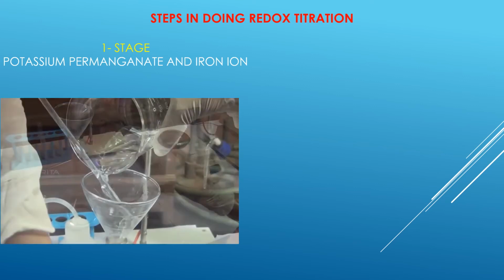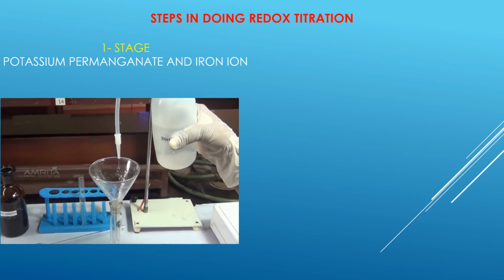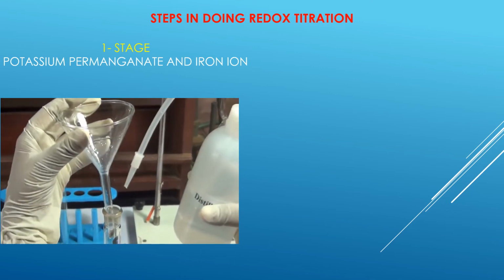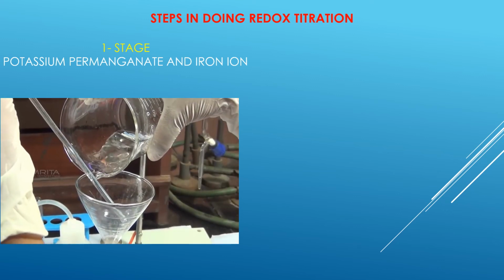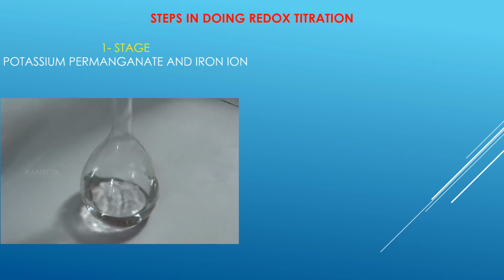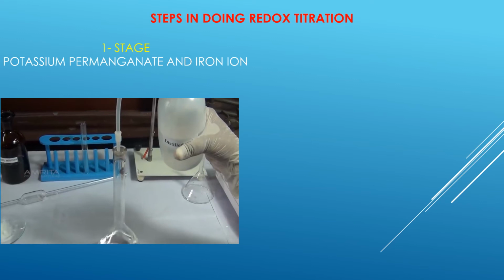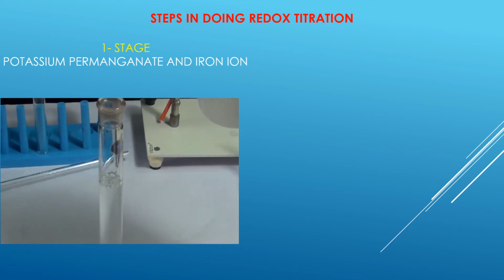Wash the beaker, glass rod, funnel and funnel tip 2 or 3 times with distilled water to be certain none of the solution has stuck to the equipment and that all solution has been transferred to the standard flask. Carefully add enough distilled water to the standard flask to reach just below the calibration mark.